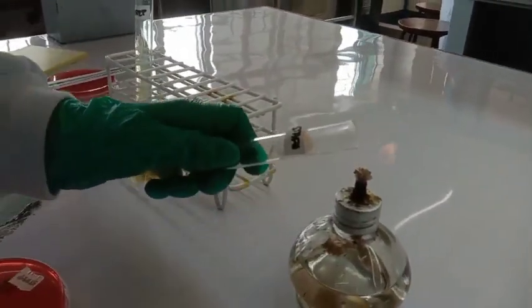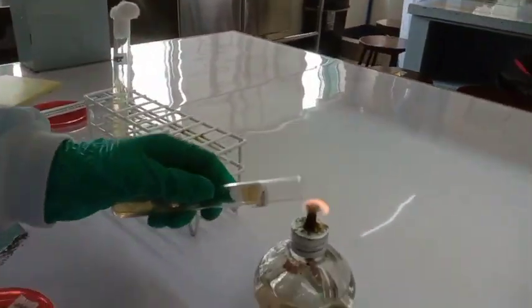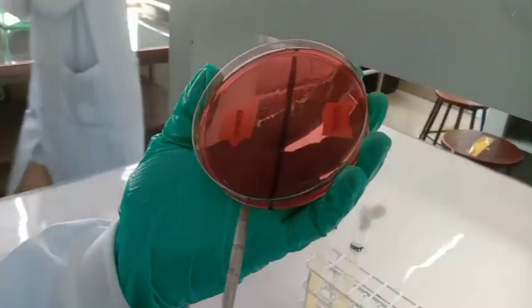Repeating the same steps for the Staphylococcus organism, always use aseptic technique in getting the colony and then streak the organism onto the MSA plate using a continuous streak.